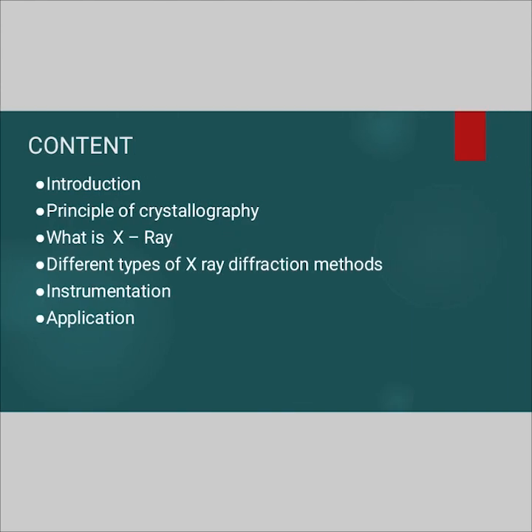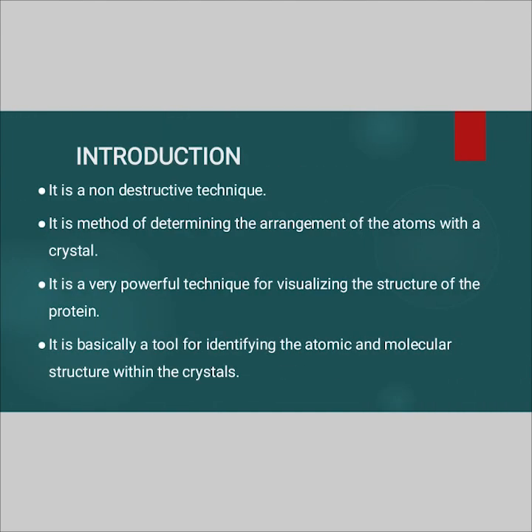So to start with, these are the contents of my presentation. Now, the introductory part. It is basically a non-destructive technique, and in this method we determine the arrangement of the atoms within a crystal. It is said to be a very powerful technique for visualizing the structure of the protein. It is basically the tool for identifying the atomic and the molecular structure within the crystal.